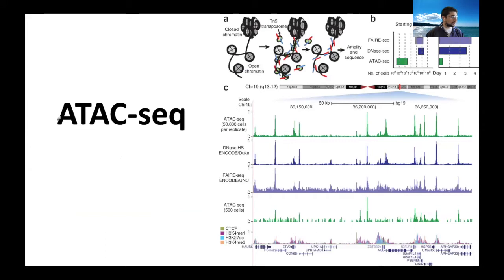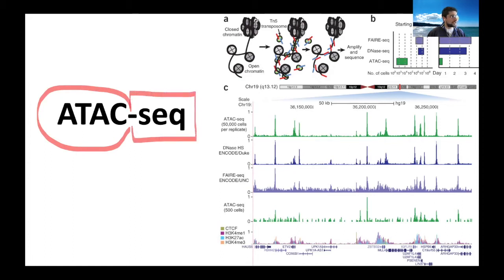Another application that I want to talk about is called ATAC-seq. So it's the assay for transposase-accessible chromatin. So what this is doing is, again, we are starting from chromatin, okay? So in the past two applications, ChIP-seq and ATAC-seq, we're not starting from purified DNA. So if you're, for example, extracting this material and you're measuring at the NanoDrop, you expect to have a lot of protein contamination, okay? That's normal.